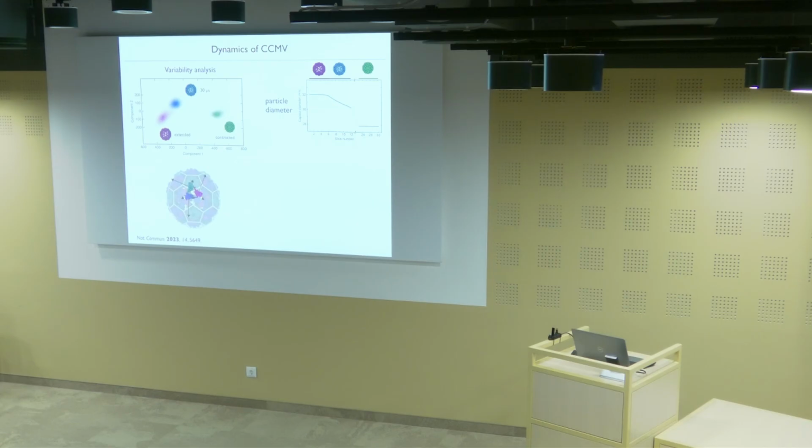And so on top of the contraction, these pentagons and hexagons that the capsid is made of rotate around their axis. You can see that the pentamers rotate at about twice the speed of the hexamers. This is something that I wouldn't have expected. And then on top of all of this, these subunits rotate around these axes drawn out as these black arrows. You can see that the subunits A, B, and C all rotate at the same speeds. However, for these particles that have contracted the most, subunit C has already completed its rotation, whereas A and B have only made it halfway. So we get a very detailed picture here of how this contraction process actually happens.